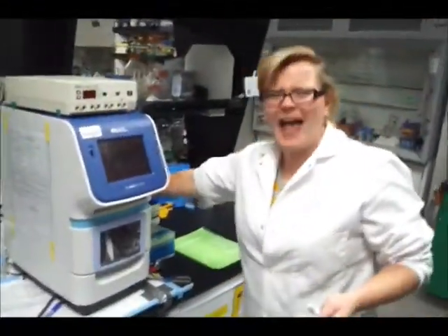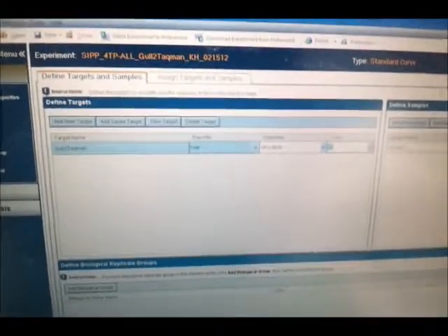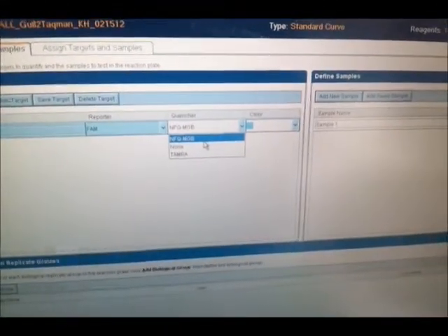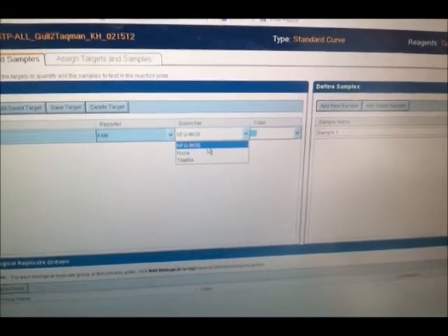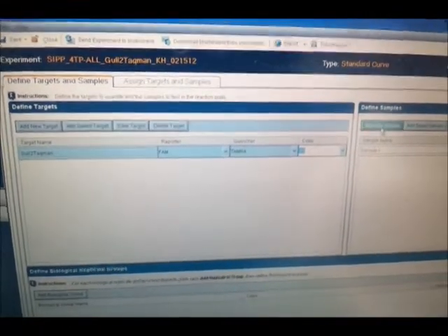Okay, we're back. Gloves on. So one thing that's really important is you have to put in your quencher and your reporter dye. For the Go, the reporter is FAM and the quencher is BHQ1. Tim is impatient. No, it's not focusing. I'm just trying to trick it in there. It would rather focus on a finger. And you usually put the quencher here. It doesn't have an option for a BHQ, black hole quencher. So we're just going to put in Tamra. Okay, and that's it. Most of the other assays are Tamra.